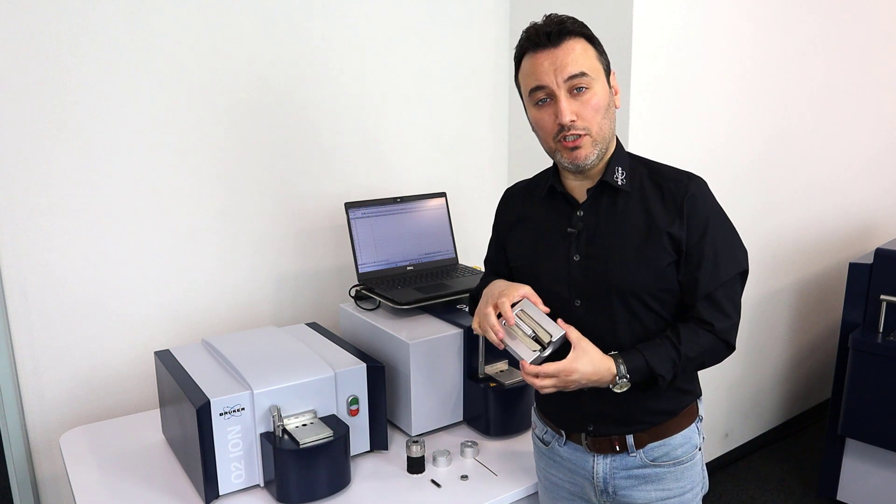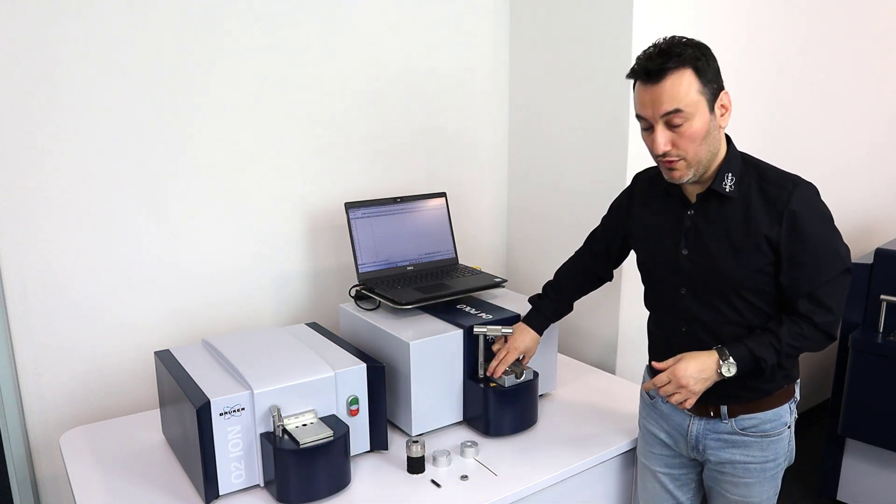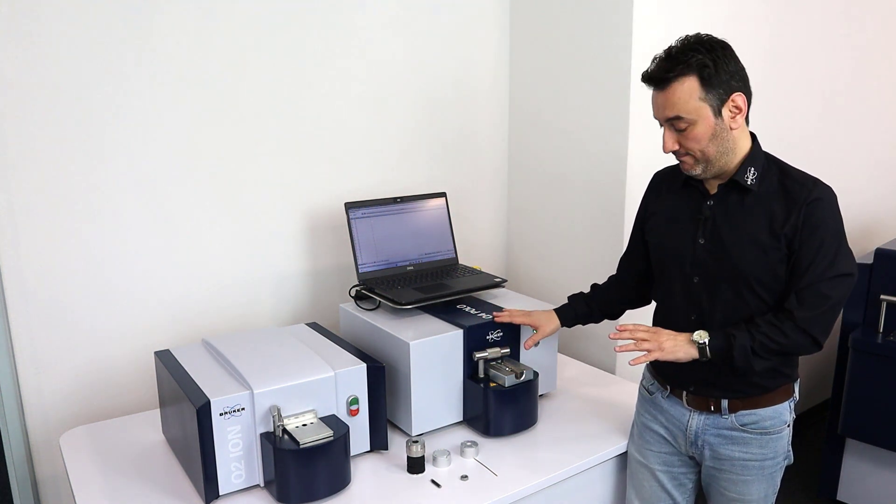This adapter is also compatible with the Q4 Polo. I can take it and place it on the Q4 Polo spark stand plate, lower the clamp, and the system is ready to run.